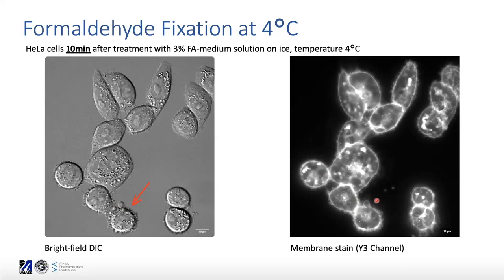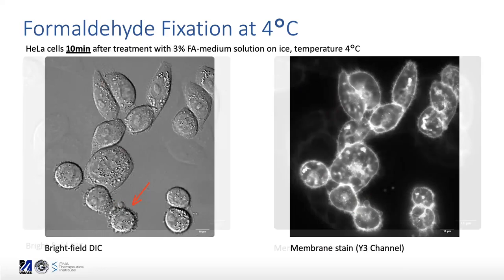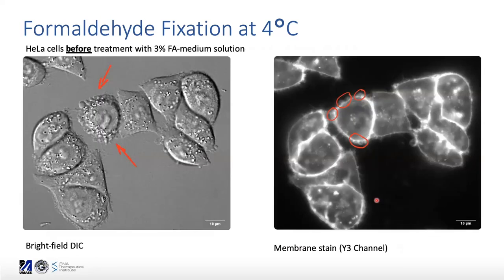The question here is whether these blebs are really caused by the fixation in this specific experiment, or whether they were actually caused by apoptosis before fixation. This image from the same experiment shows cells before application of formaldehyde, and what is highlighted with arrows is actually a dying cell. You can see it also forms very tiny blebs, which is a very common thing for dying cells to do.